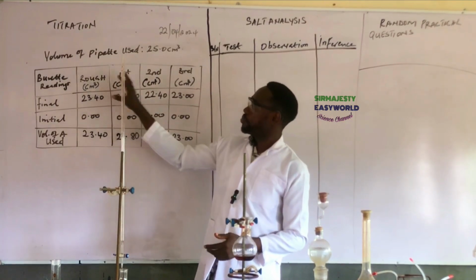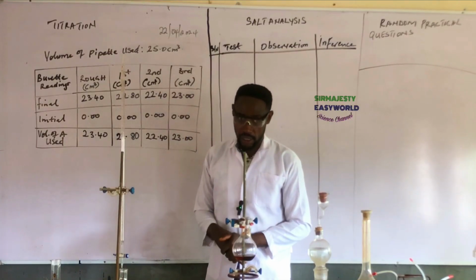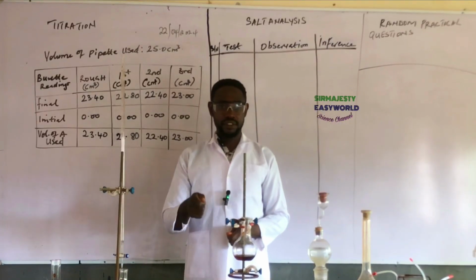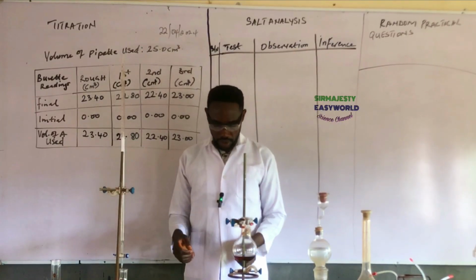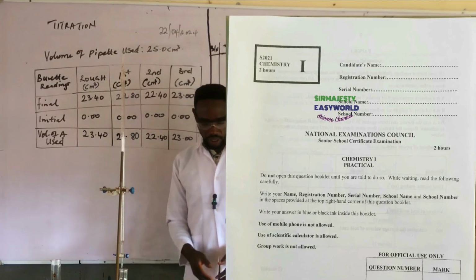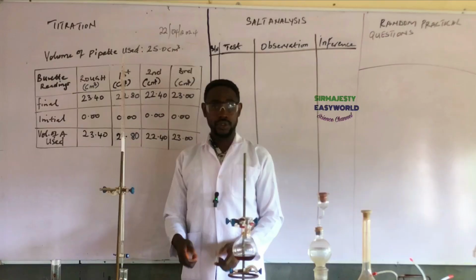For titration, you make your table. Make sure your table is neat. Avoid cancelling your table. Then, when they give you a script, there is no substitute, like the script that will bear your name already at the back, as you can see there on the screen. That you cannot request. If you make mistakes on the table, you are doomed.